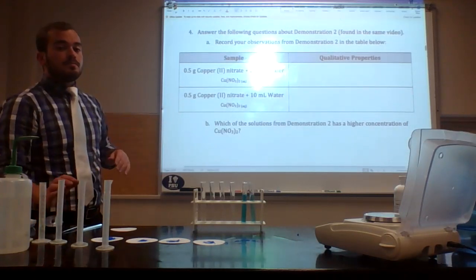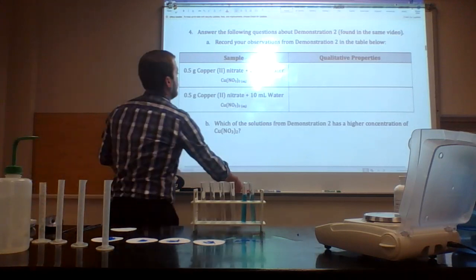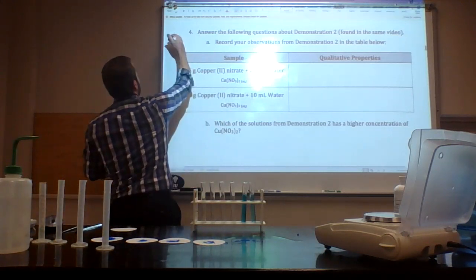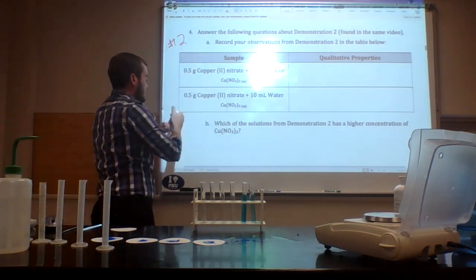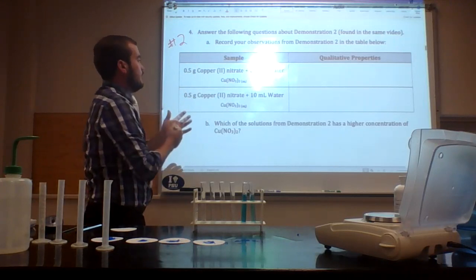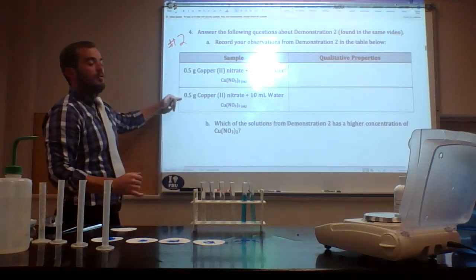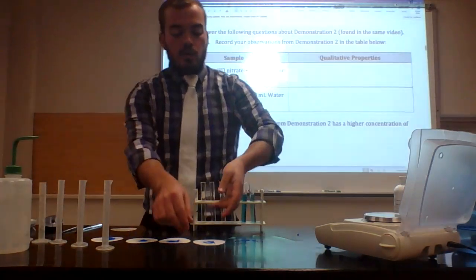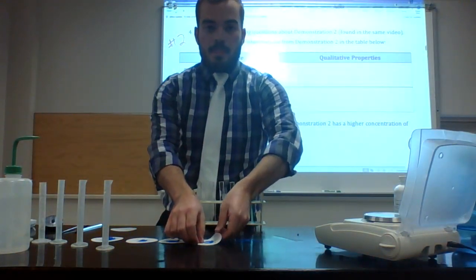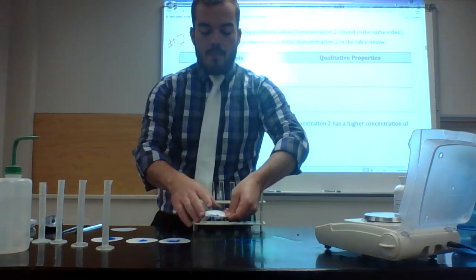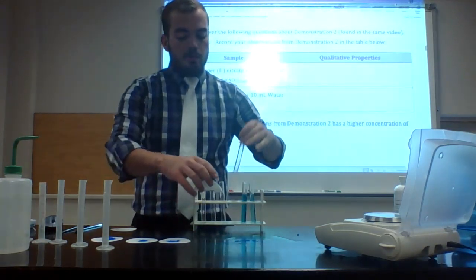Next, demo number two. We're going to continue to use copper(II) nitrate, just a different volume of water. In both of these I'm going to use 0.5 grams of copper(II) nitrate, just not the same amount of water. So I have my copper nitrate and test tube.